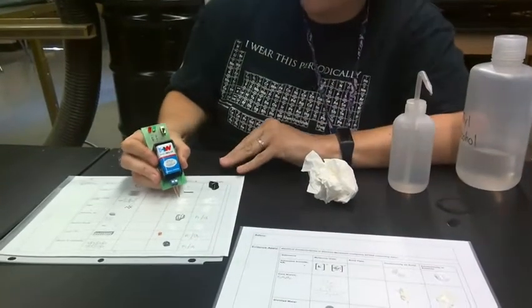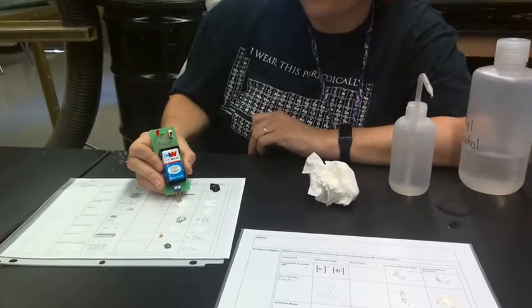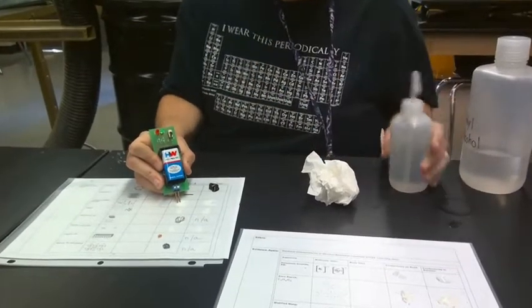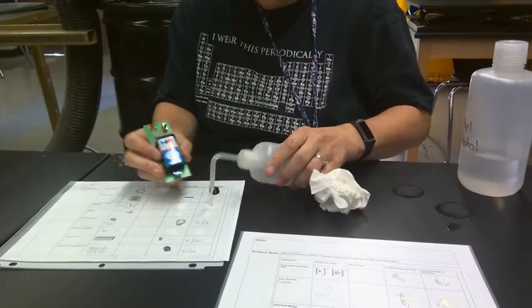Next I have solid sodium sulfate. I'm going to make my sodium sulfate solution.